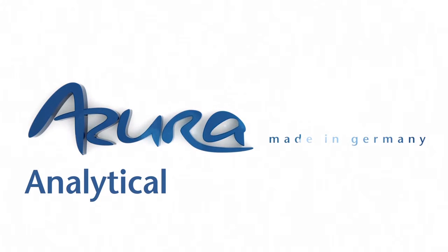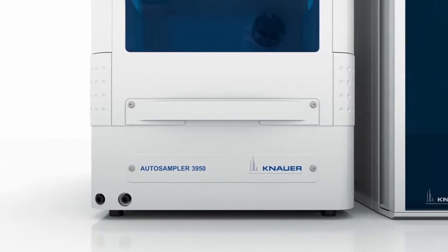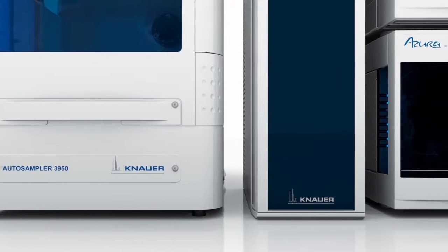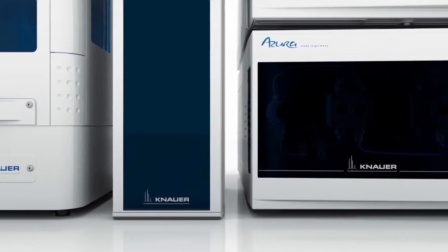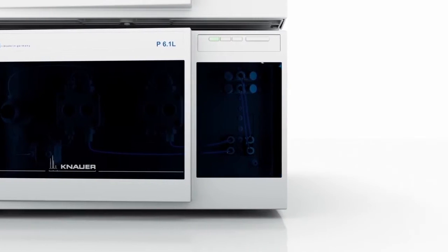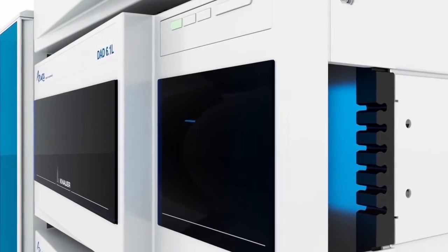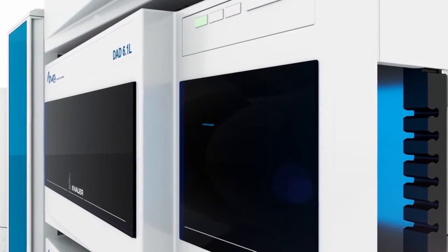Azura Analytical HPLC. The HPLC and UHPLC systems of the Knauer-Azura liquid chromatography instruments are designed to support and facilitate your work, whether during routine analysis or demanding separation tasks. Azura systems are the right tool to overcome your analytical challenges.